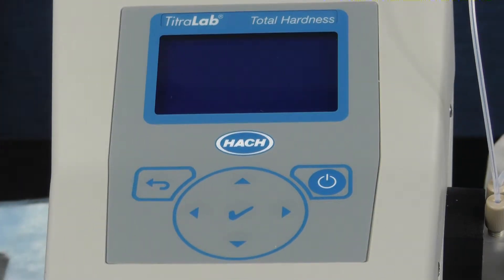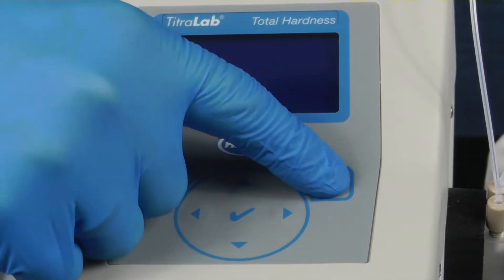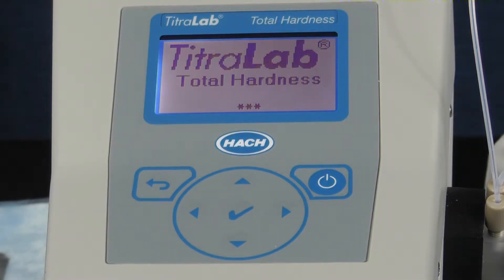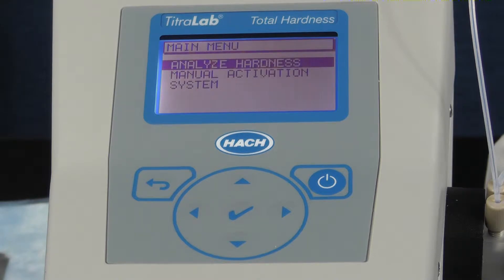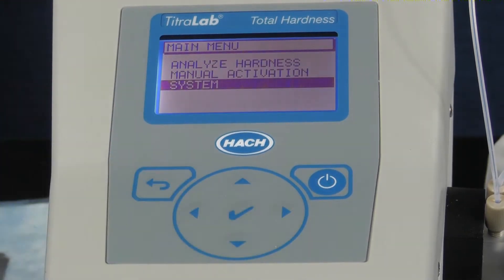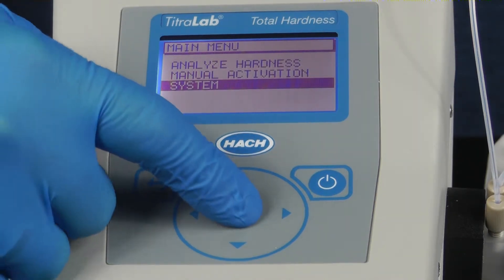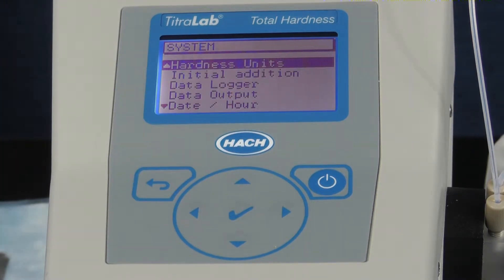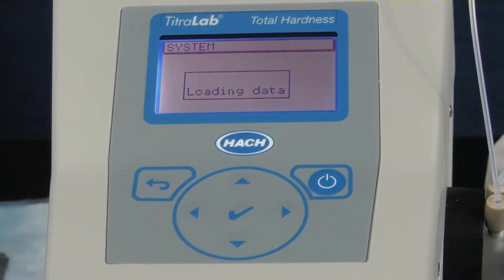To make sure you are in the correct units for your results and to check the results factor for the buffer you are using, turn on the instrument, select system, select hardness units, select milligrams per liter CaCO3 from the list.